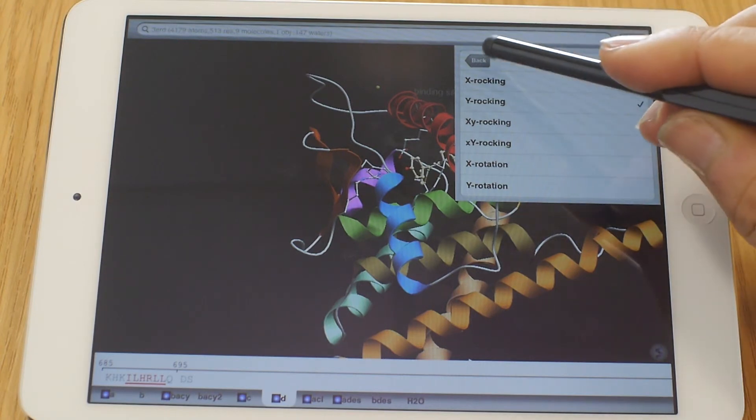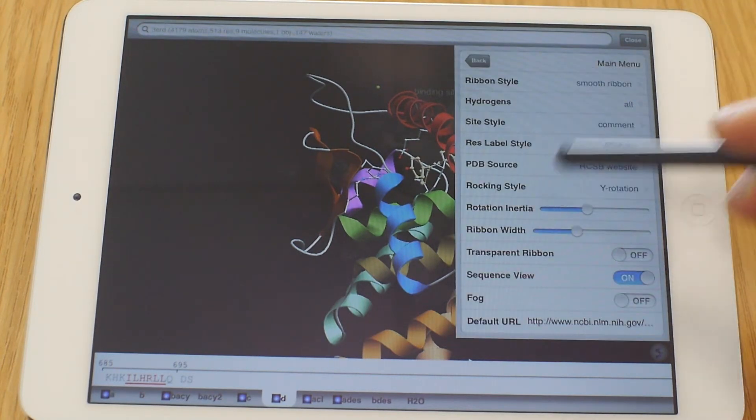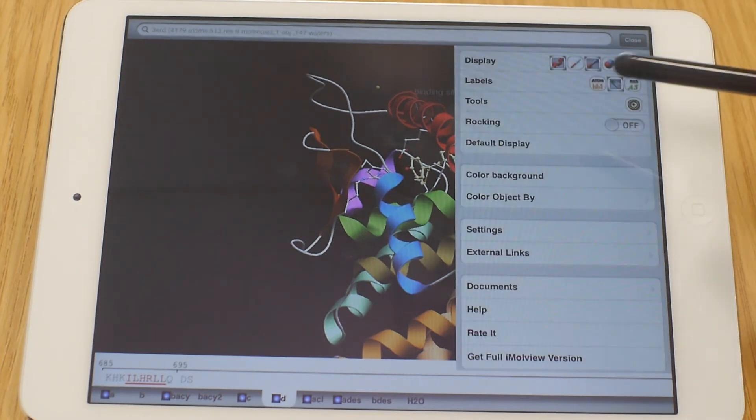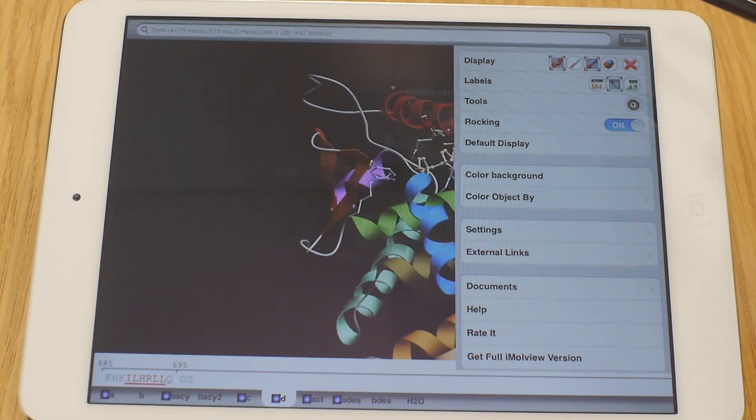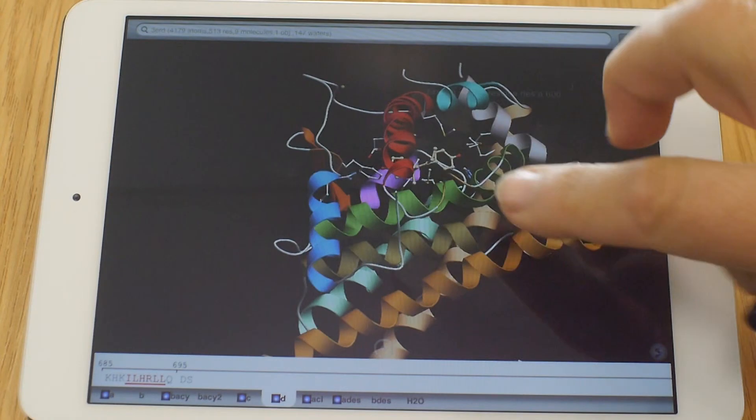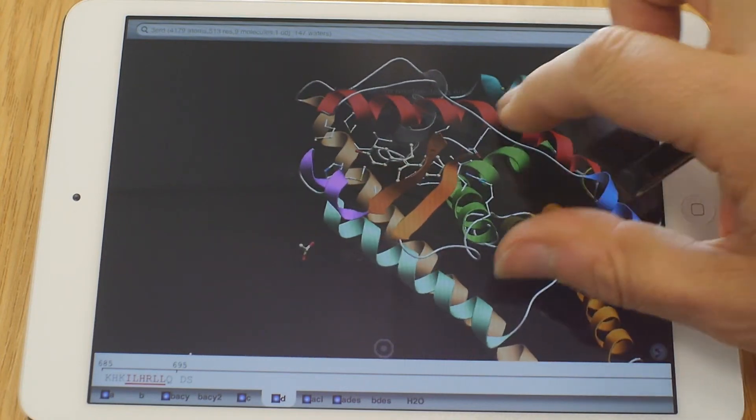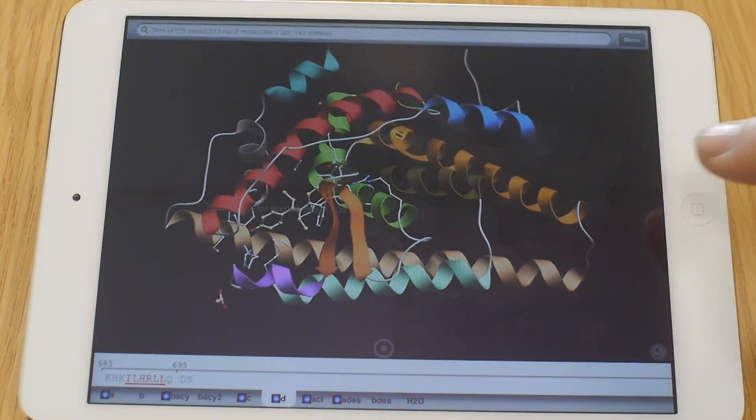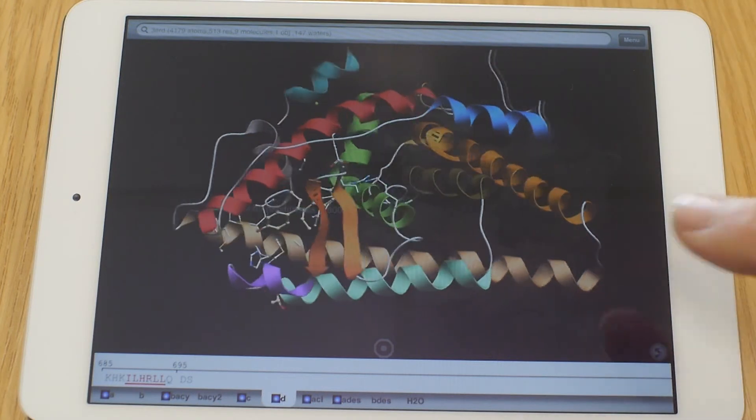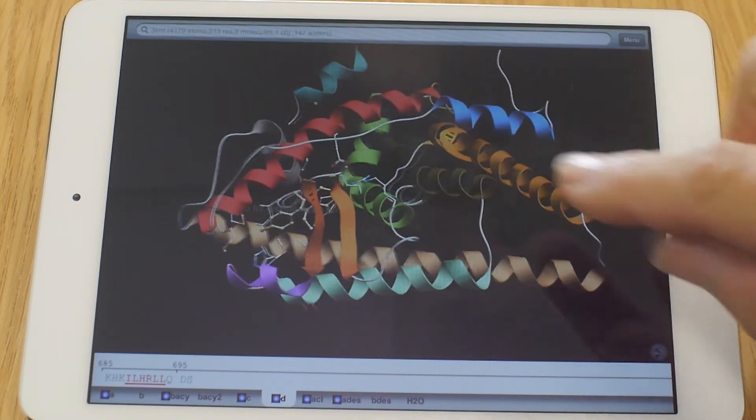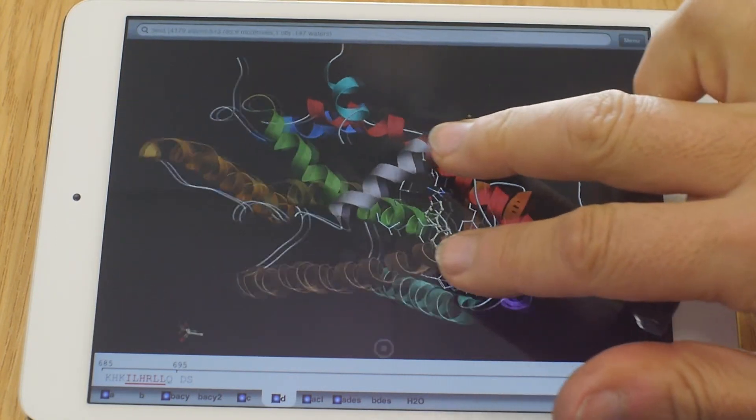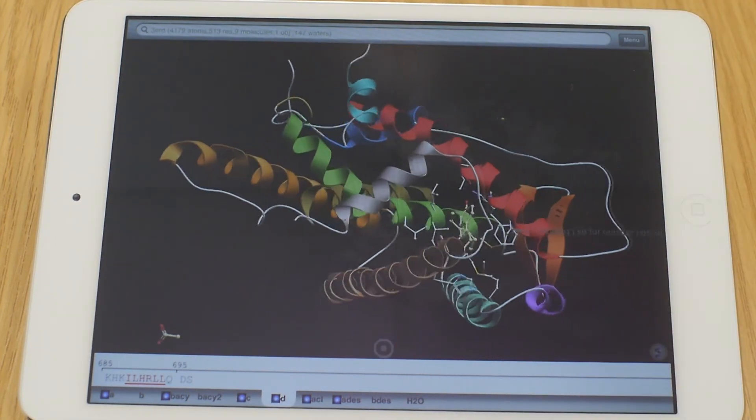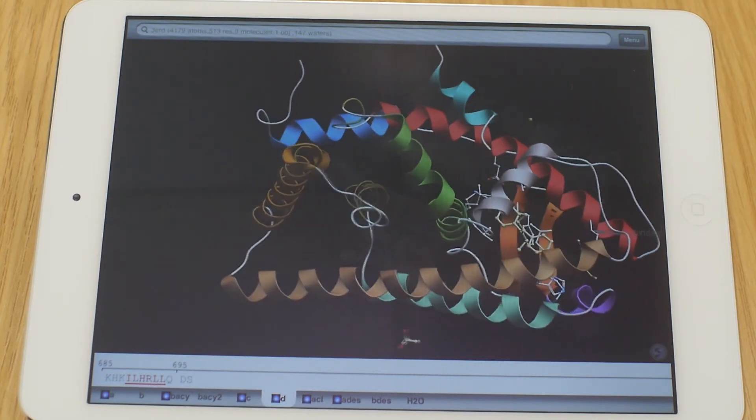So let's go back to the main menu in this case. And in the main menu we can now set rocking, which is off, to on. What does this do? Now it gives you a little bit of a more three dimensional idea. You can also rotate it. So it will always be rocking, which gives you an idea how it looks in three dimensions. Because don't forget, this is just two dimensional obviously. And with movement, our brain tries to reconstruct the three dimensional structure of this. See if you find it helpful.